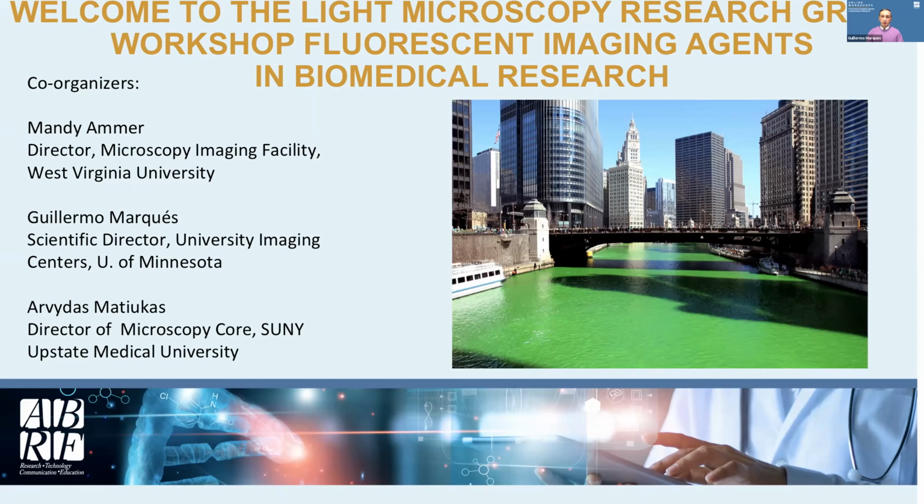So it is very important, we think, that people who work in shared resource facilities are fully aware of what fluorescence means, what it is, where it's coming from, what are the characteristics of fluorescent molecules that are going to impact their usefulness or not for the different kinds of fluorescent-based assays that we have to perform on a daily basis in our research laboratories.